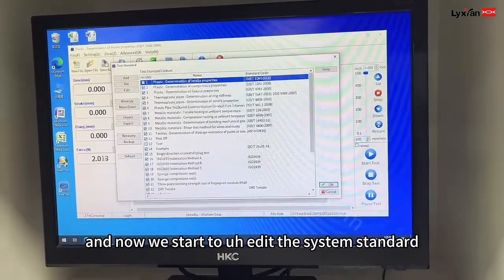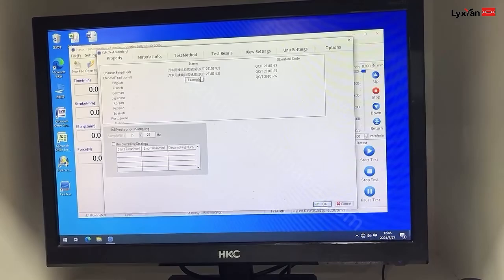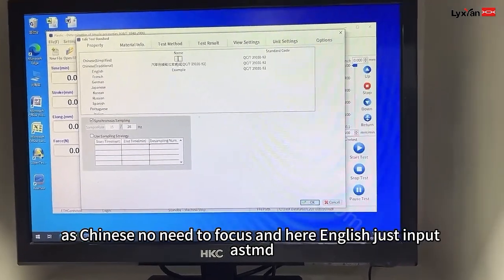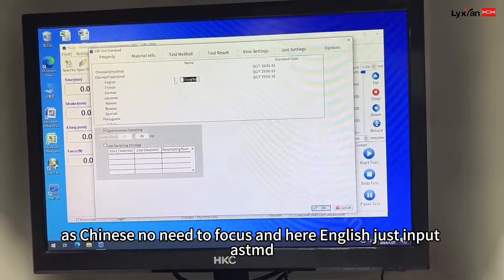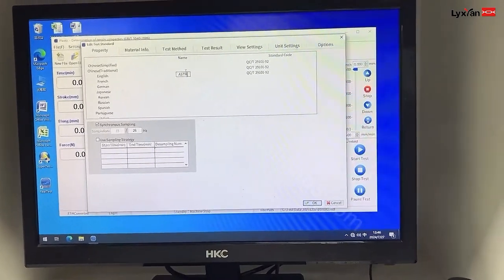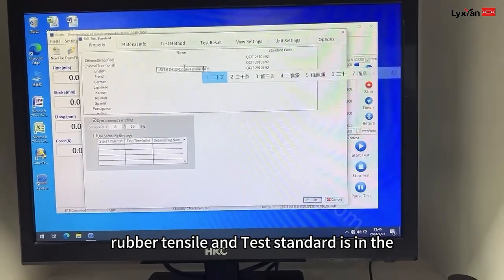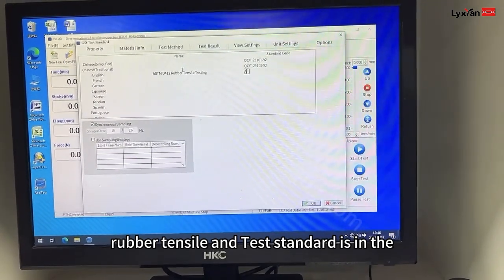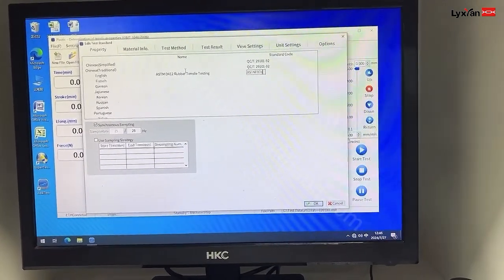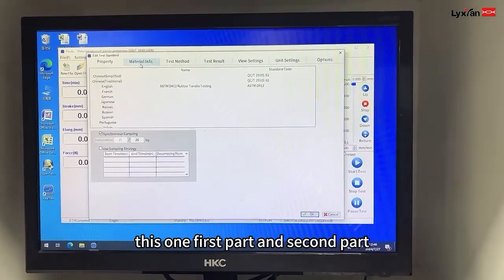Now we start to edit the tester standard. For the Chinese, we don't need to focus. Here, English. Just input ASTM D412, rubber, tensile testing. And the tester standard ASTM D. Okay, this was the first part.